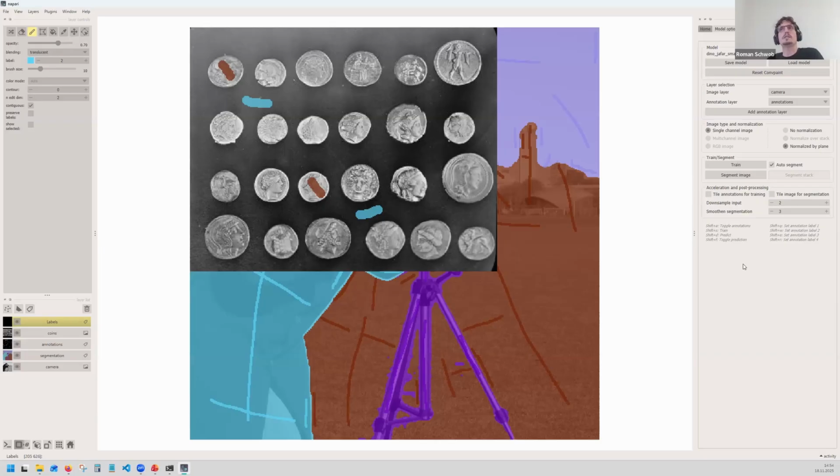Having said this, it's also important to know your feature extractors. These two work really well, for example, on CNNs, convolutional neural networks, because they always capture the information for a pixel in the surrounding of the pixel.